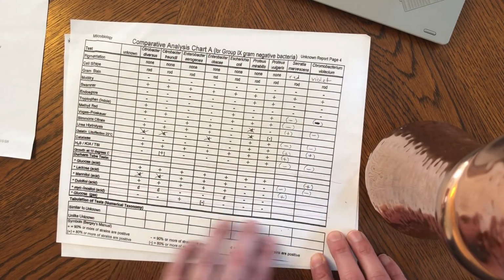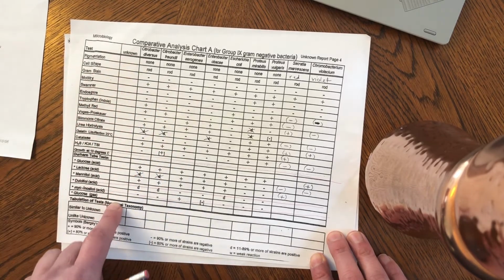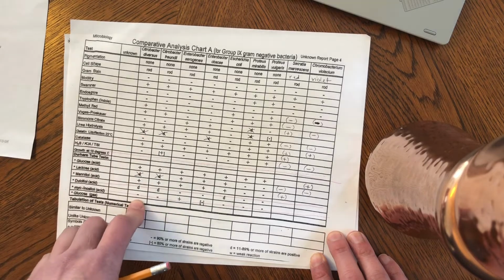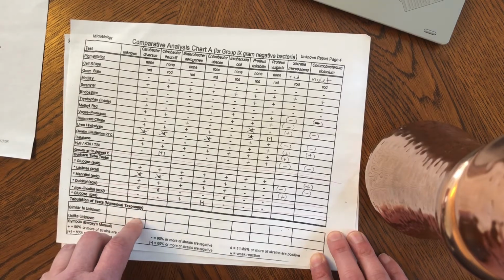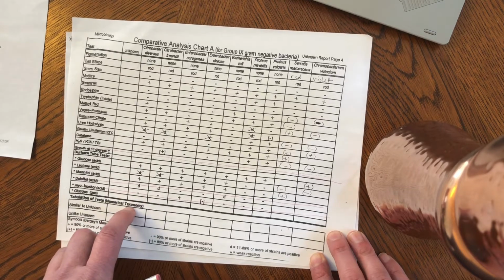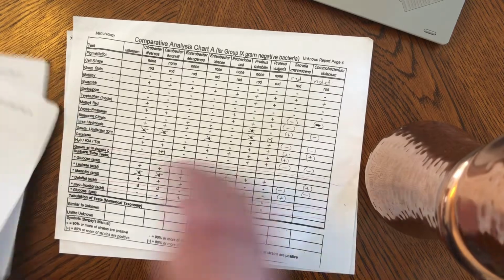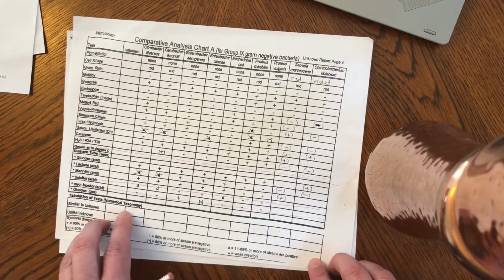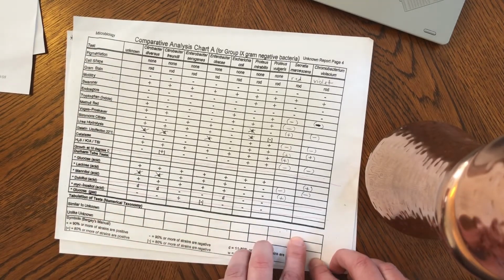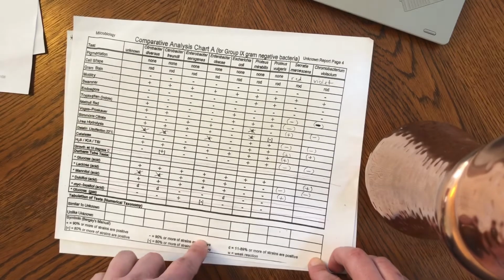You need to do the numerical taxonomy. You need to write your unknown test results here. And you need to see how many test results you can compare to your unknown at the bottom number here. How many test results match your unknown at the top number there. And then unlike unknown underneath that, just like in my reference sheet. And then when you're done doing all of those numerical taxonomy counts, the ratios, one of them will be the best one, and that's the one that is your unknown.